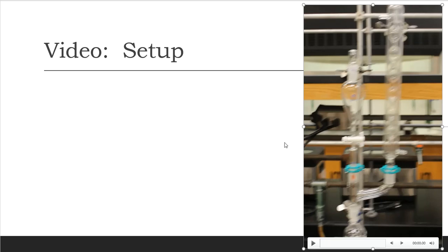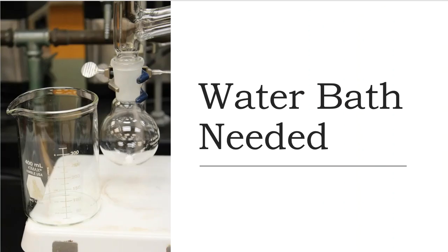Okay, so there's my demonstration of the setup that we will be using together in the laboratory space. And of course, I keep telling you this, but a water bath is eventually going to be needed. So that's why I have this beaker set over to the side. I'm not using it yet, I haven't done anything with it, but eventually we will need it at some point.